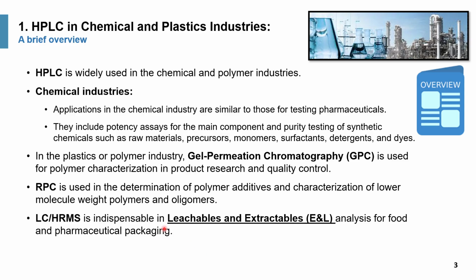These are indispensable assays for food and pharmaceutical packaging applications to protect the public health, mostly by HPLC in couple with high resolution mass spec. However, we will not cover these aspects in this video.